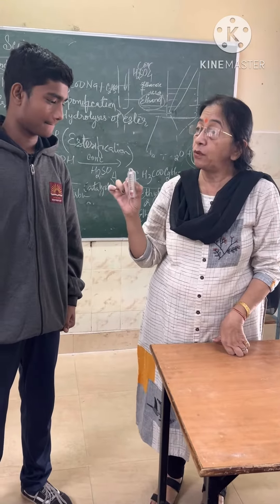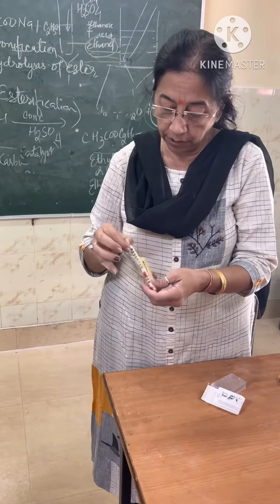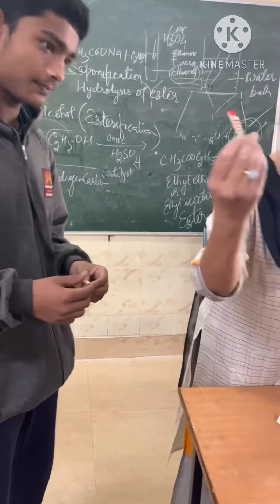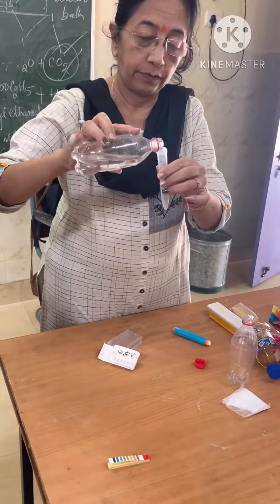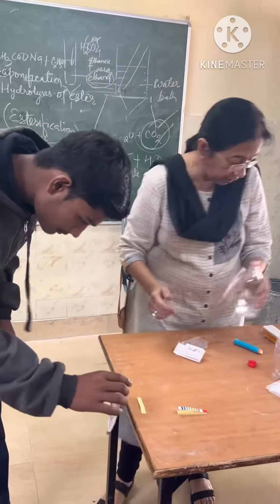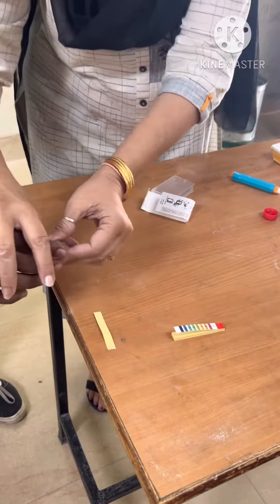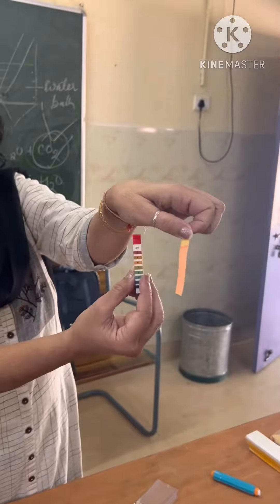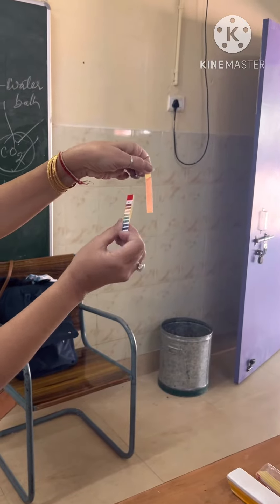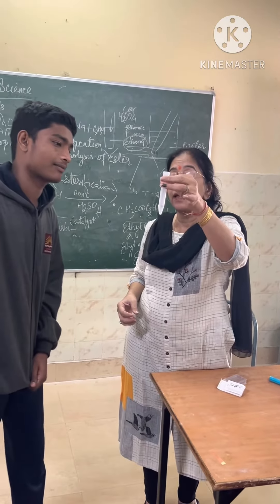This is a paper to test the pH value of ethanoic acid.